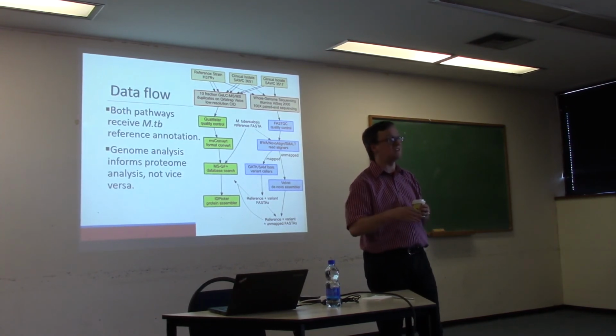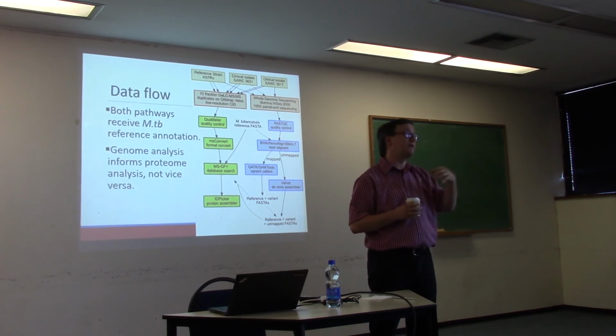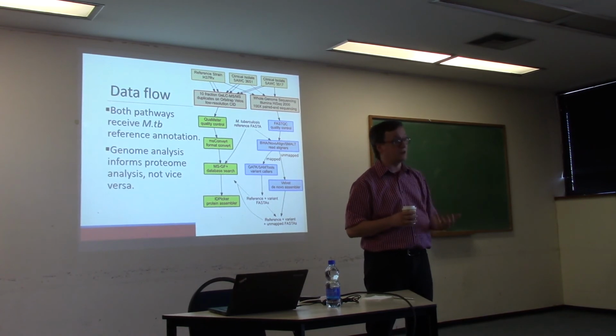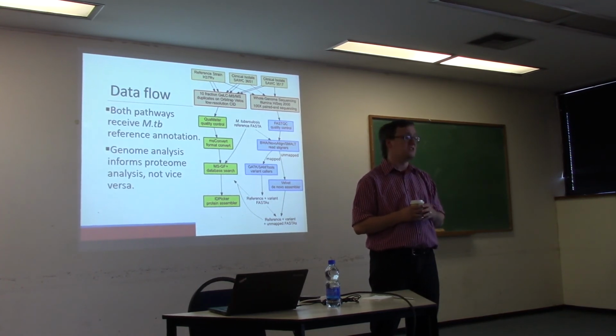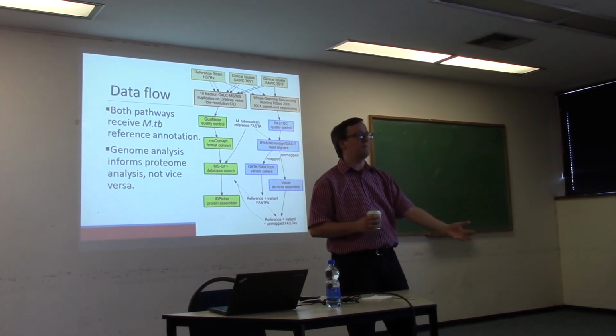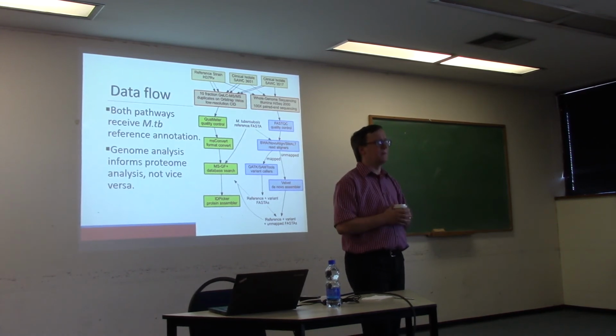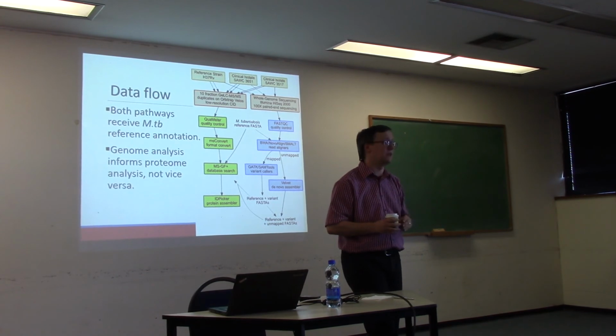We actually had a pretty big sensitivity hit compared to what some of the labs have, for example, Rudy Aebersold's group at the ISB has run 24 fraction sets on a very similar kind of instrumentation. And their sequence depth in terms of number of proteins wasn't hugely greater, but the number of peptides they saw per protein certainly went up. So the quantitative measurements that we were able to make were somewhat restricted by the nature of the way the experiment was set up to begin with.